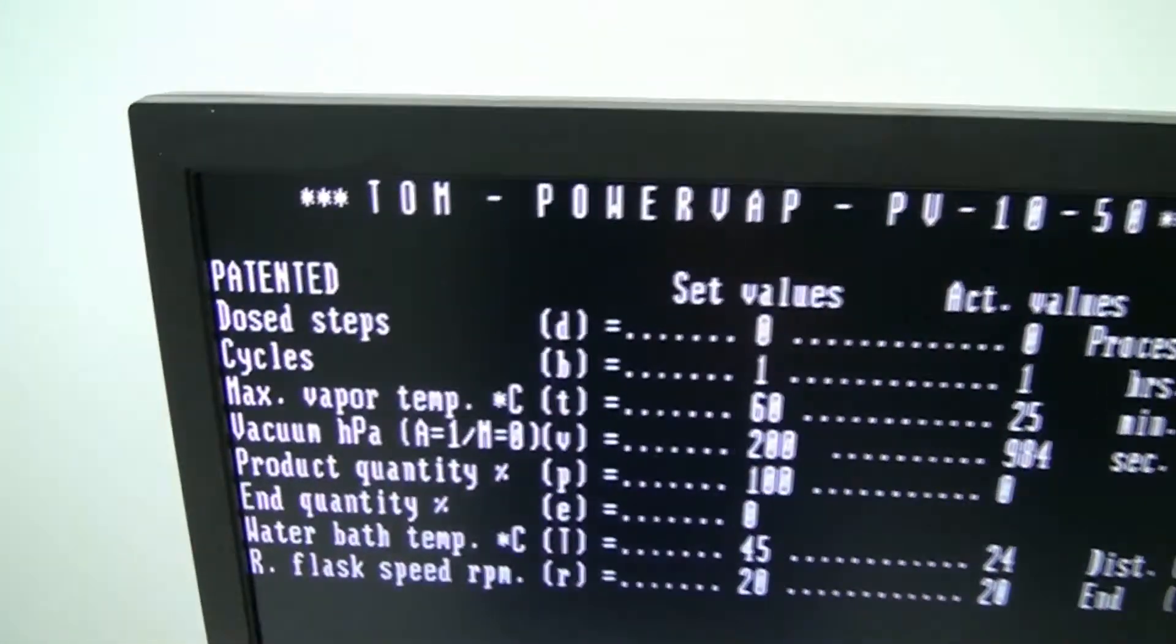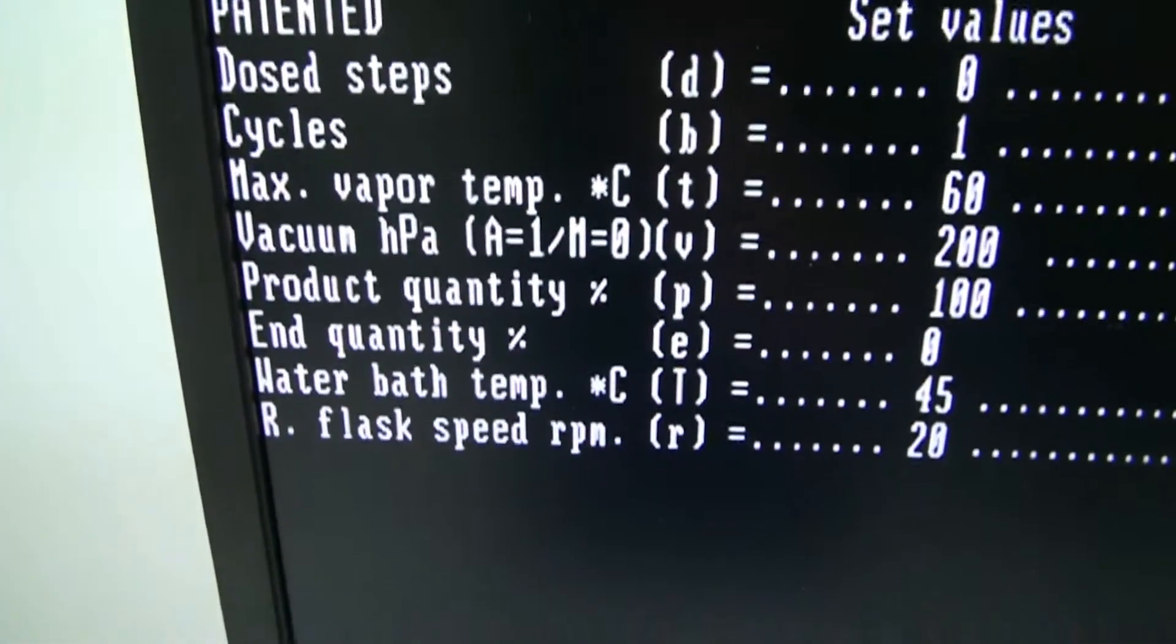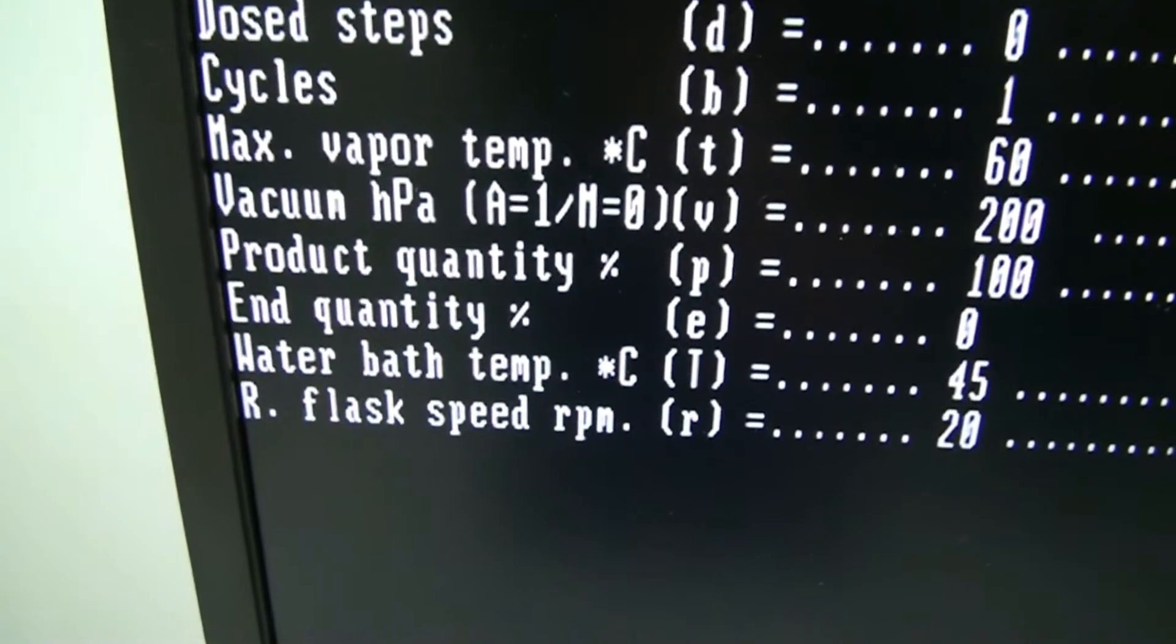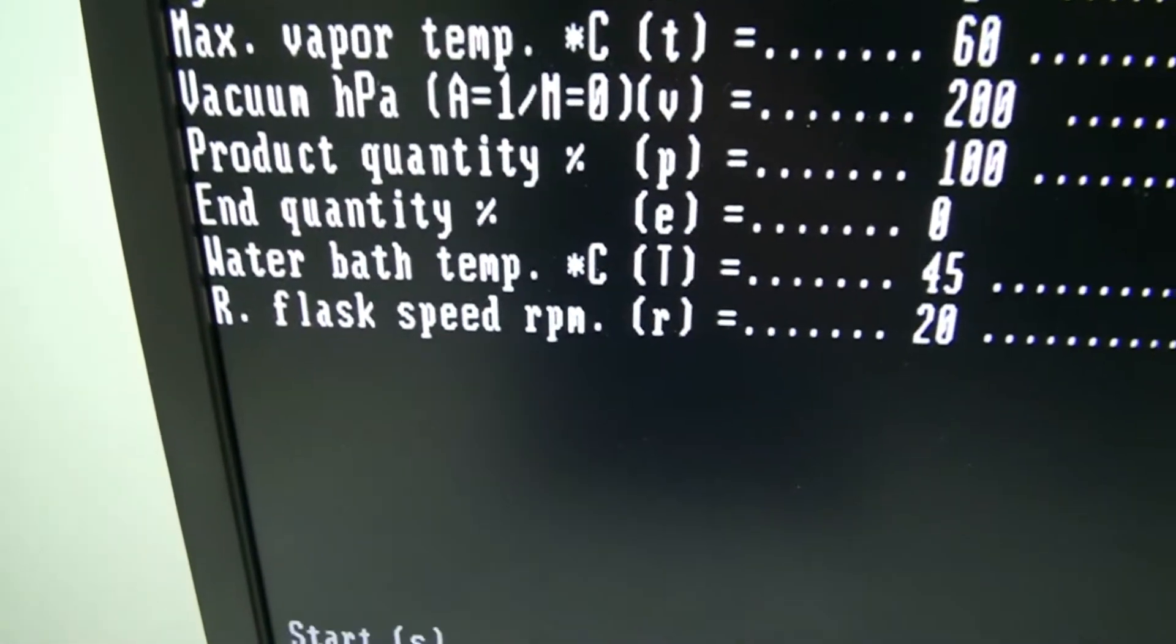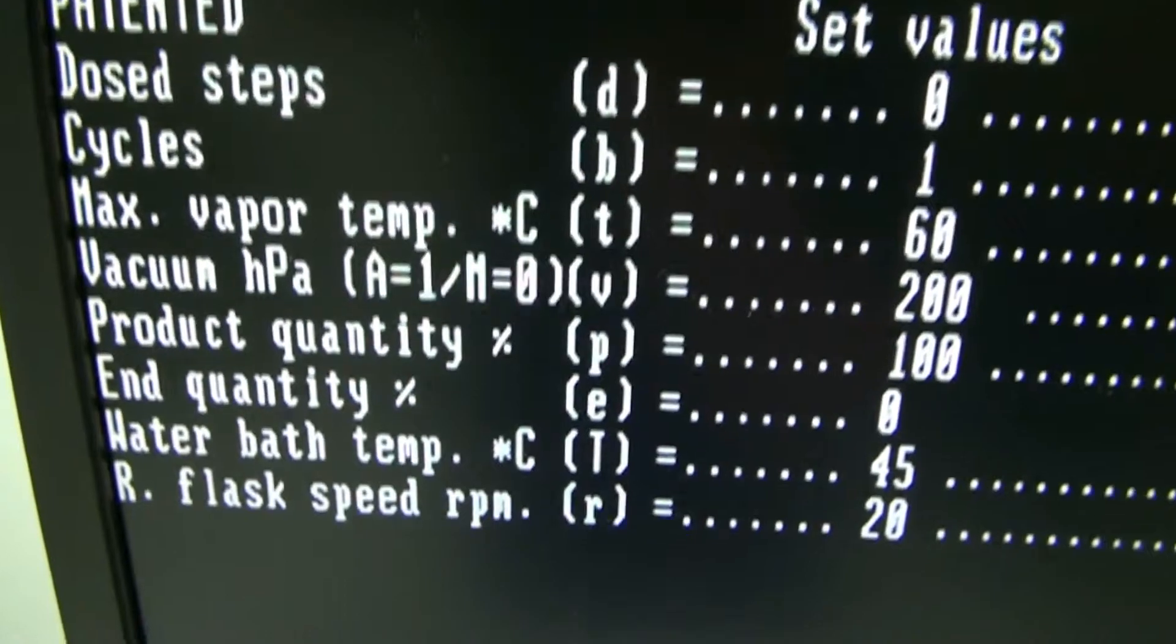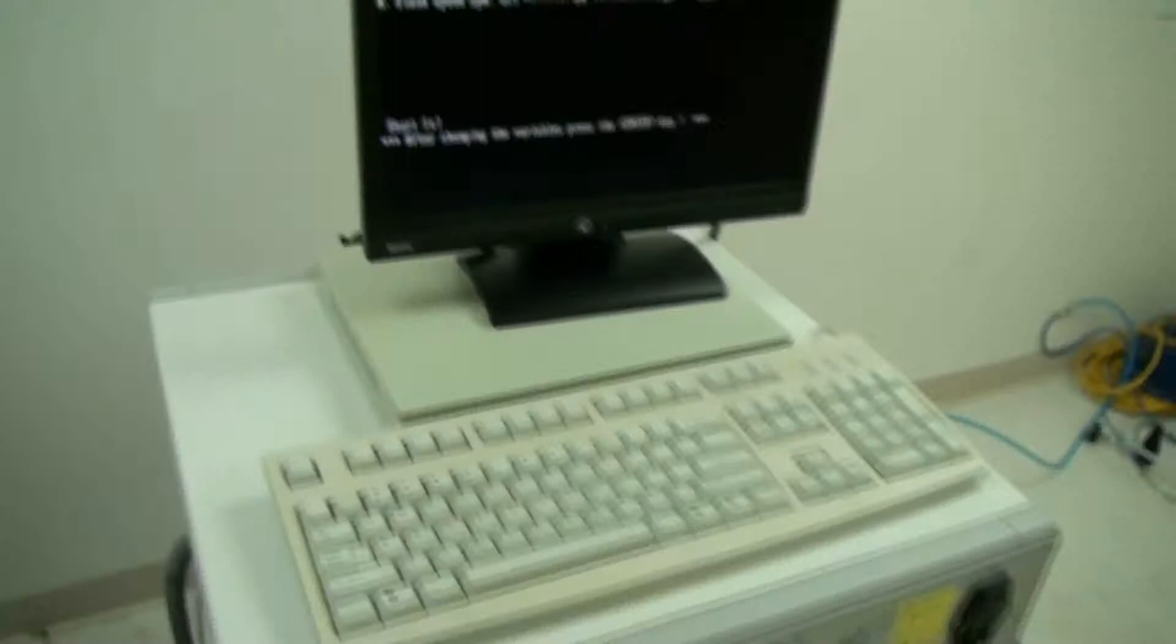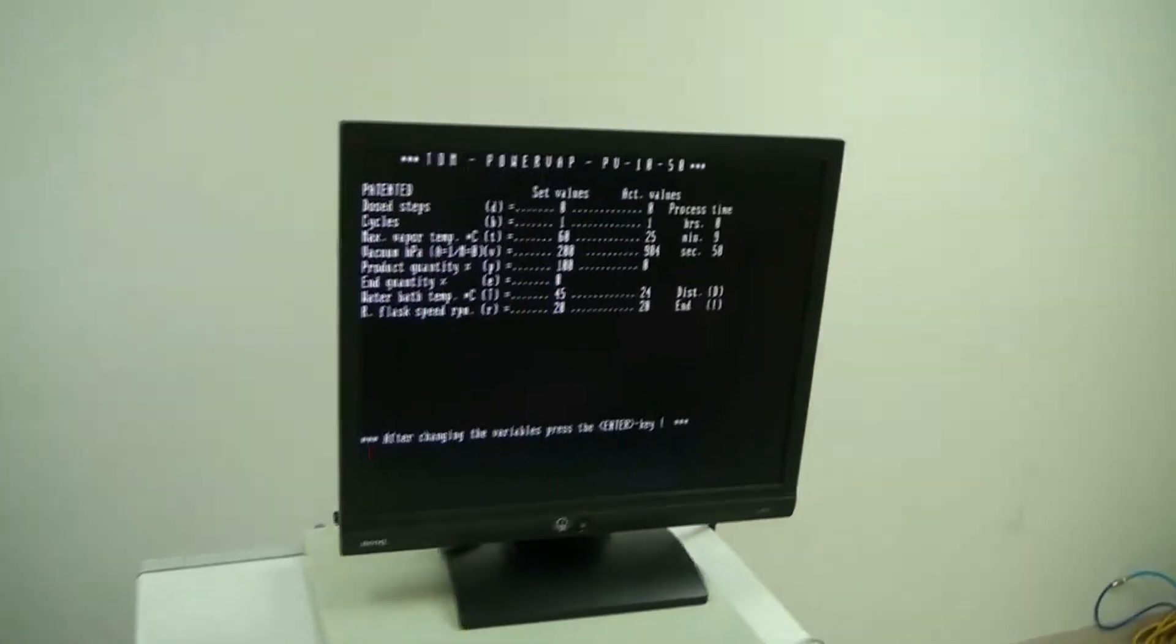Off to the left you have all your settings that you can actually change: the dose step cycles, vapor temp, vacuum, product quantity end quantity, water bath temp, and then the flask speed. You can set all those values by just simply hitting the command key that's designated there. We're gonna show you a little bit what you can do.